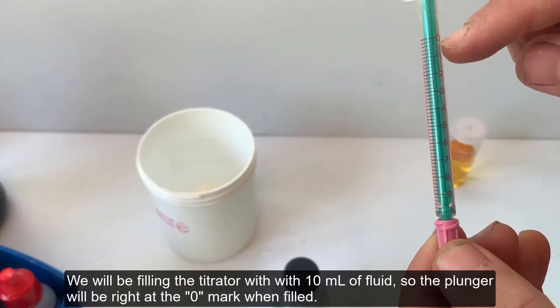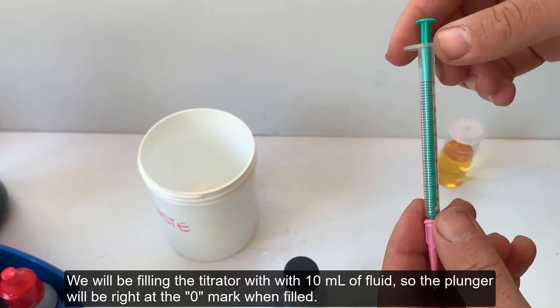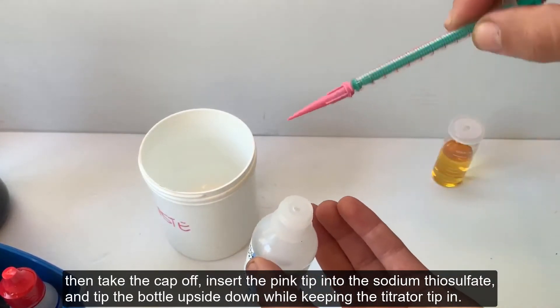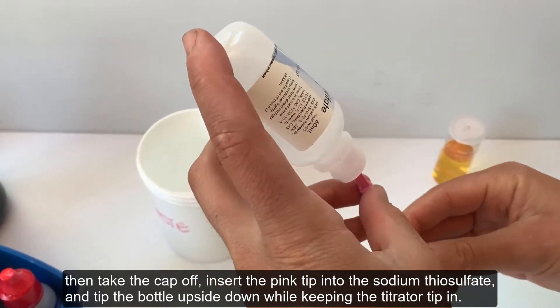We will be filling your titrator with 10 milliliters of fluid, so the plunger will be right at the zero mark when filled. Make sure your plunger is fully depressed, then take the cap off, insert the pink tip into the sodium thiosulfate, and tip the bottle upside down while keeping the titrator tip in.